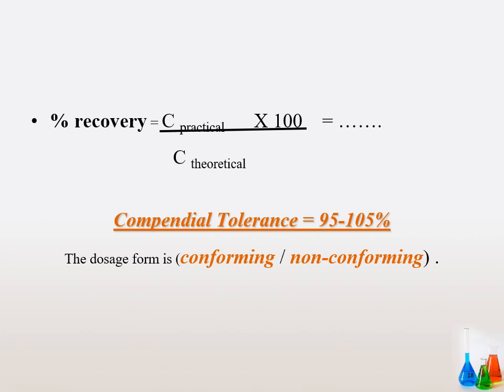We will use this practical concentration to calculate the percent recovery.